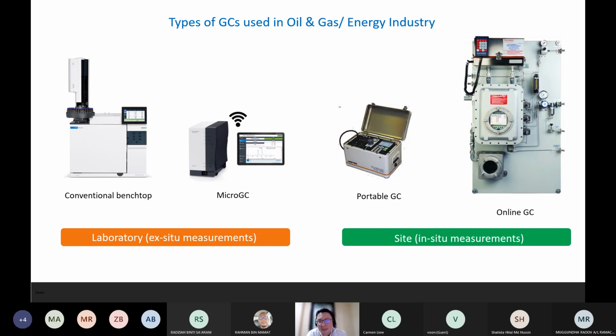Most of the time, these systems are what we call explosion proof, because bringing in electronic components or anything with a heating system is very dangerous when you are surrounded by pipes that have hydrocarbon inside. Imagine there's a leak, hydrocarbons or gas get out, and if there's a heated system there, it can explode. So a lot of safety features are required for these systems to function in the refinery. One of which is to your far right, a relatively weird looking setup.